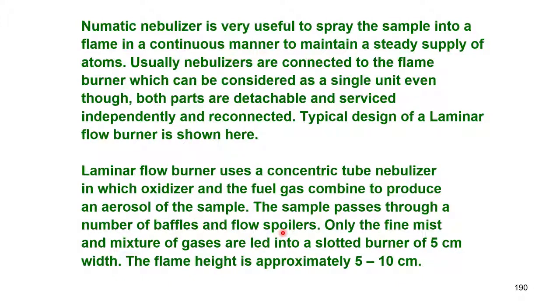A pneumatic nebulizer is very useful to spray the sample into a flame in a continuous manner, because we do not want to do it manually every time. We want to do it in a continuous manner to maintain a steady supply of atoms, because, if you remember, a flame is a dynamic system. The flame is burning, and I want to introduce my sample. So, what happens to my sample? My sample also keeps on flying out of the flame after some time, maybe a few microseconds.